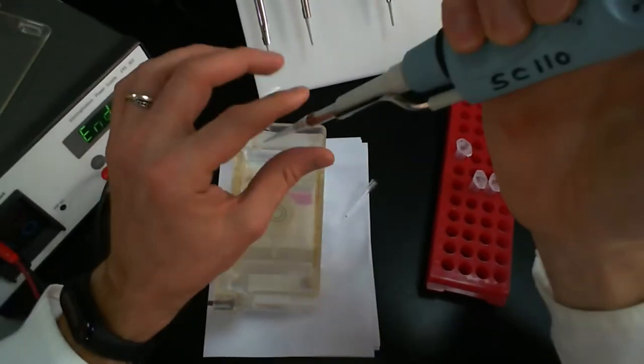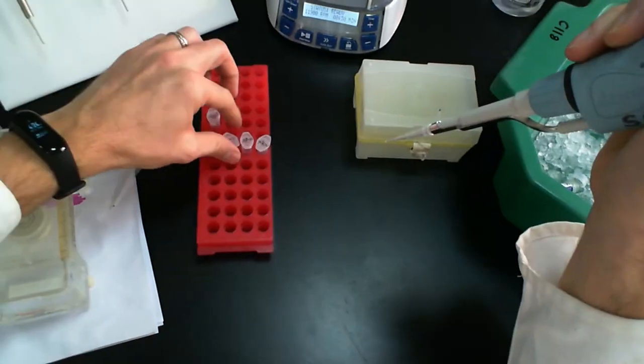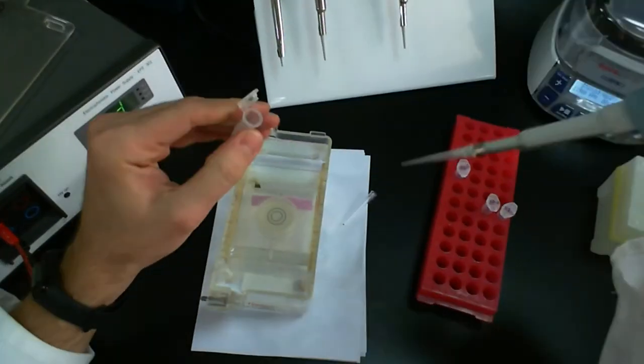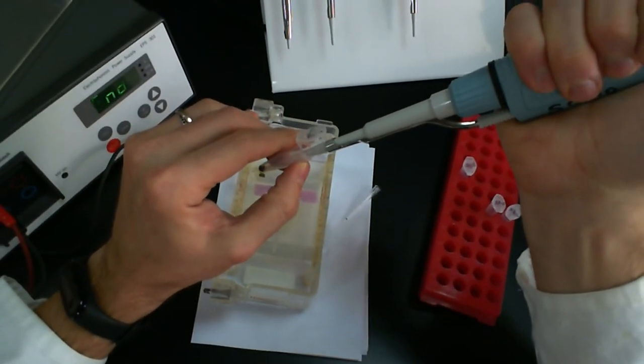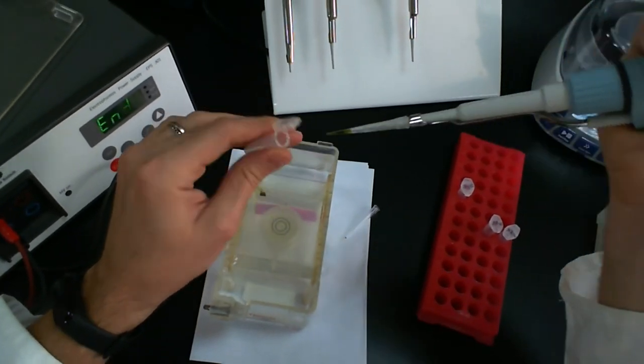You don't want to go too deep, because you could puncture the well. Okay, so I'm going to get rid of this tip. I'm going to load the next sample. Okay, so again, 25 microliters into the next well. Okay, there it is.